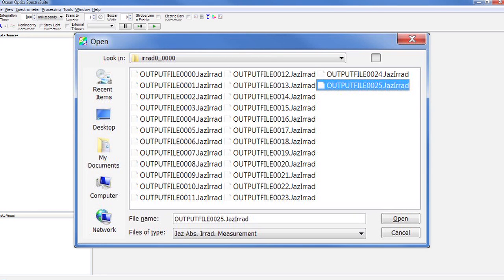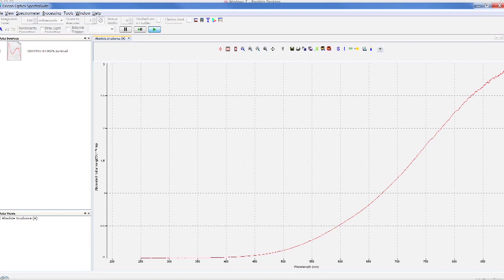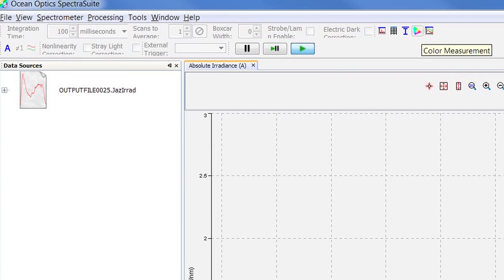Once the file has been loaded, SpectraSuite automatically opens a graph of the Absolute Irradiance measurement data in microwatts per centimeter squared per nanometer. The data file appears in the Data Sources pane.